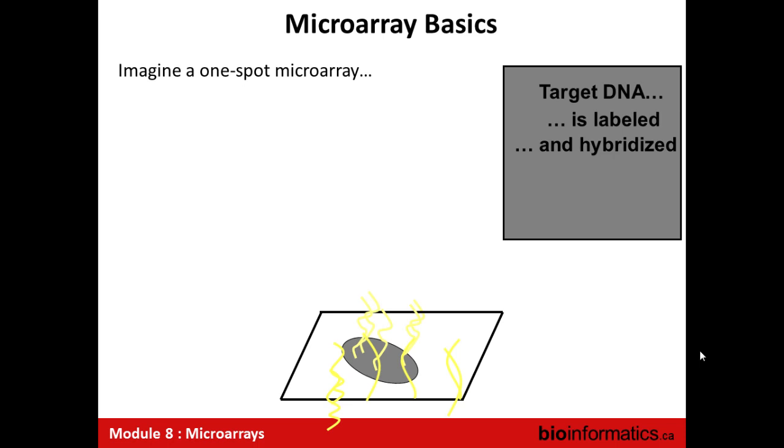And at the next step, we're going to have all sorts of non-specific hybridization, kind of noise, and we wash that away. This is basically stringent enough washing conditions that will remove non-specific hybridization, but keep the one that we really want. Now, this makes microarrays super flexible, because we can do things very cleverly. We can wash so stringently that only perfect matches remain. Great, genotyping now. Or we can relax the washing, so we can allow there to be certain mismatches, which is really good if we have samples from a different species that we don't know very well.